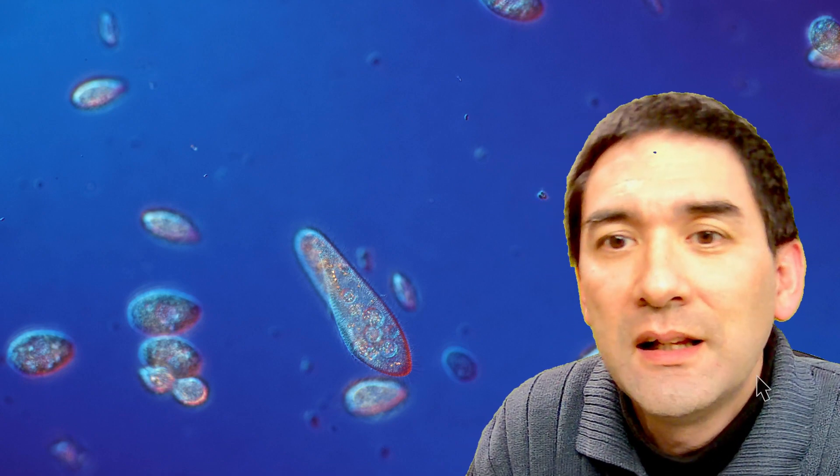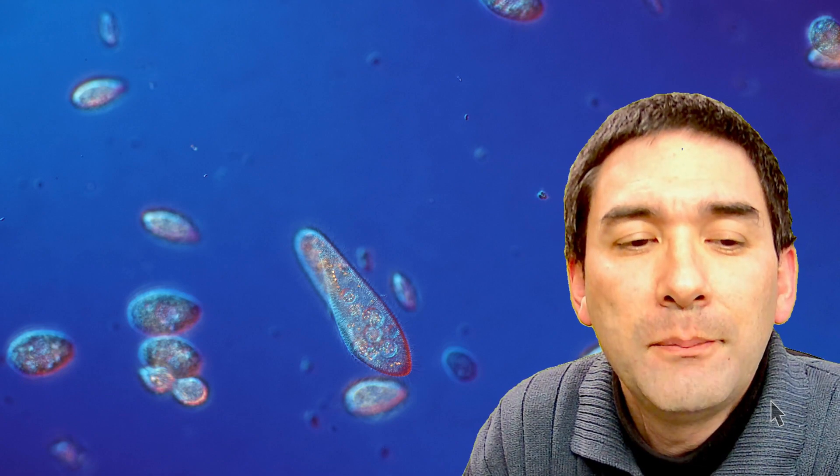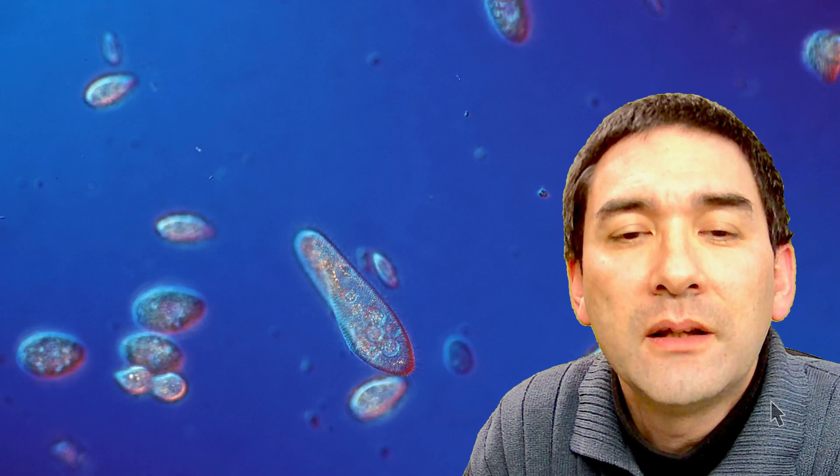parts of cells and also bacteria, are going to end up inside the paramecium and are then digested there.